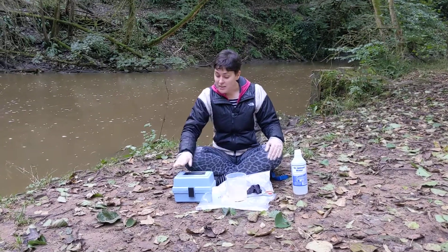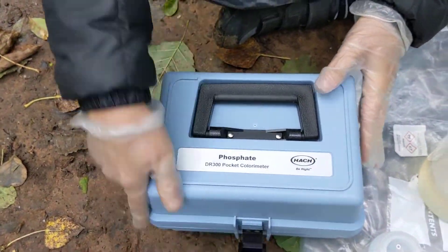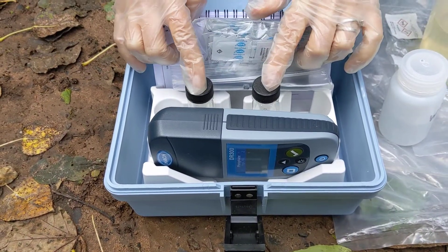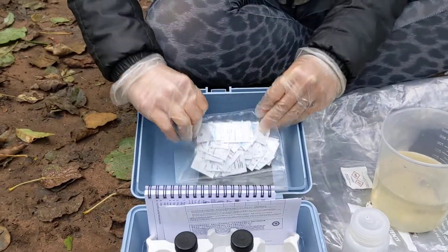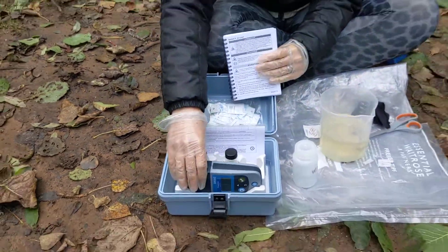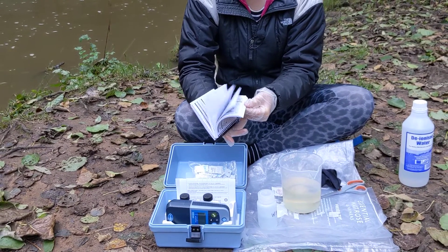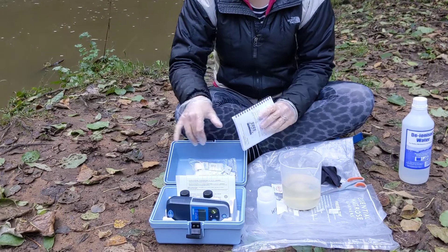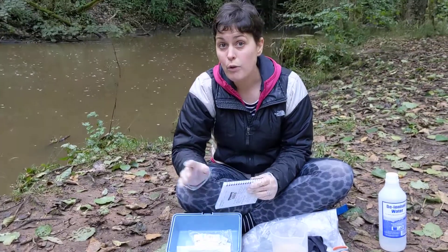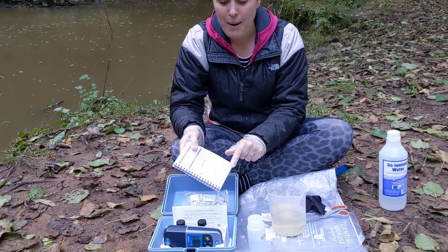To measure phosphate using the DR300 Pocket Colorimeter, you get a blue box like this. Inside you've got a colorimeter, two glass cuvettes and caps, a pack of reagents, and some instructions. First time you open it you'll also have some batteries, which you need to insert into the battery compartment at the back. The instructions are very comprehensive but only give you information on how to operate the device. To run the specific phosphate test, refer to the instructions online or in your volunteer coordinator kit. If you need a reminder, there's a very basic overview on page 11.